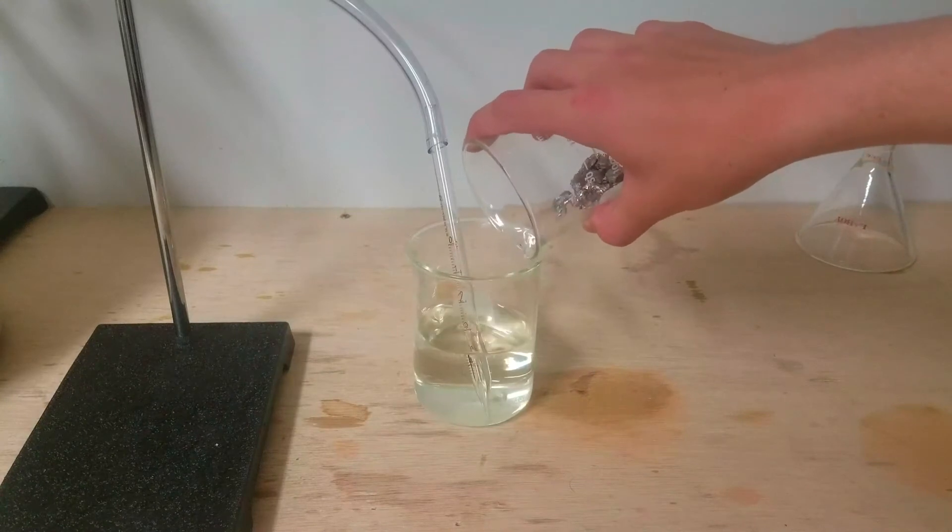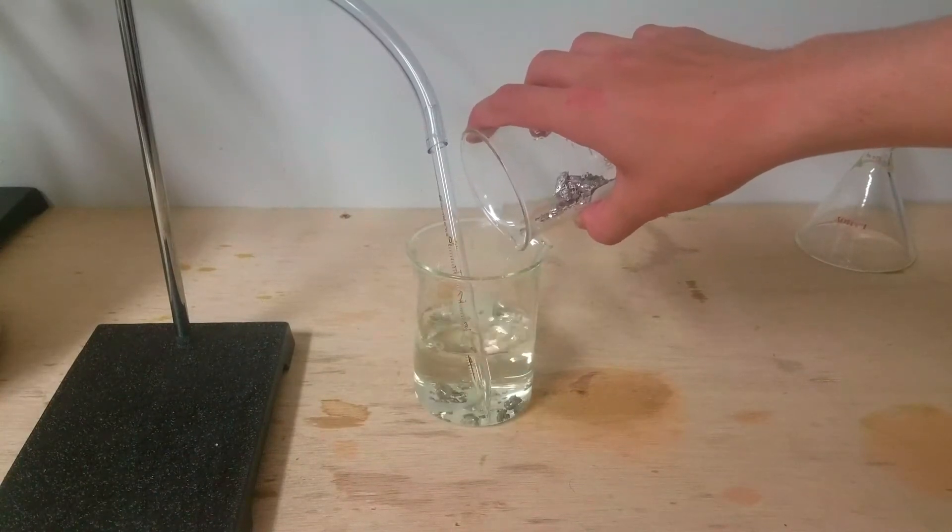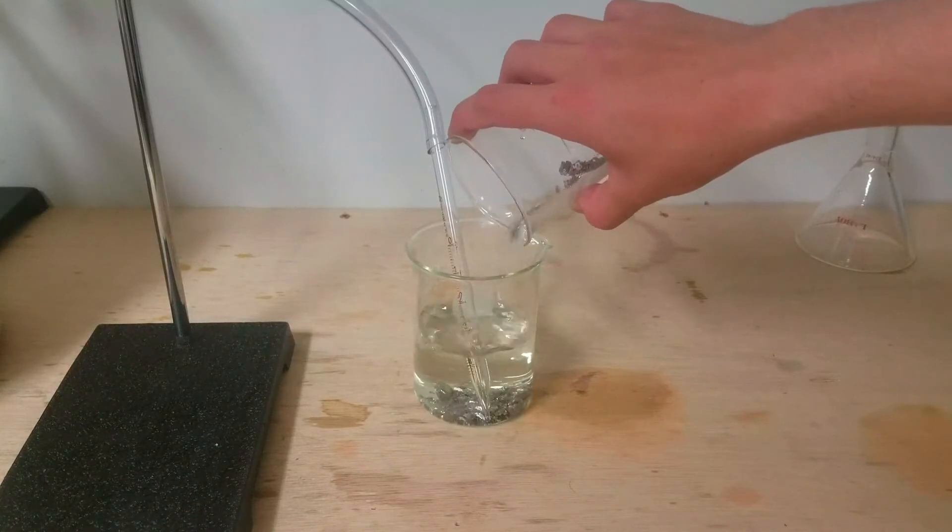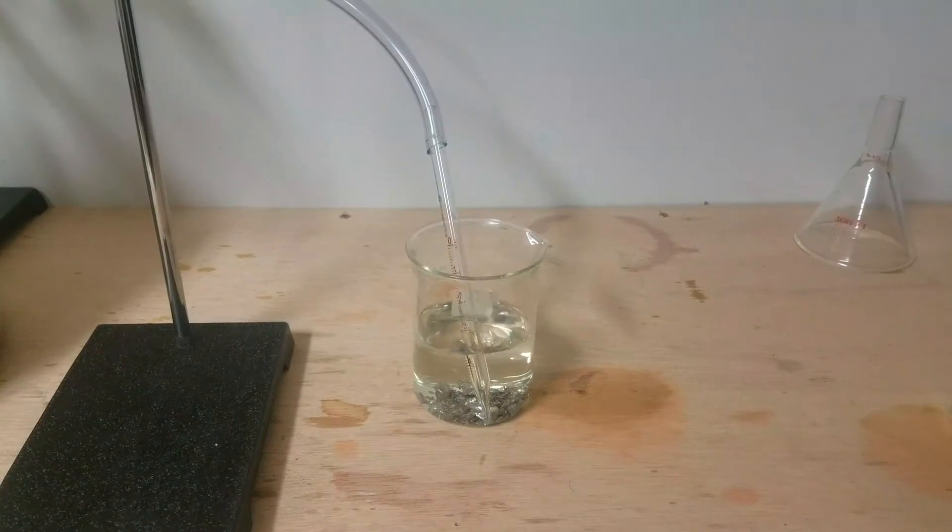I then dumped in the bismuth metal and let it sit for a while. Honestly, I was expecting a slightly vigorous reaction, but I was soon disappointed when nothing really happened. After a few minutes of nothing happening, I added a lot more distilled water and a few drops of the bromothymol blue indicator. The solution turned much more yellow, indicating a pH of about 2 or less.